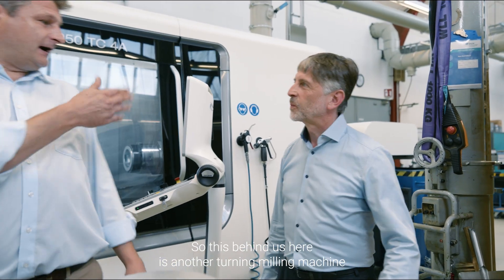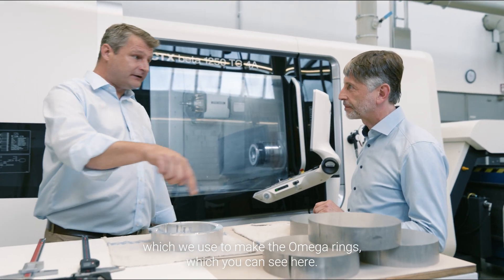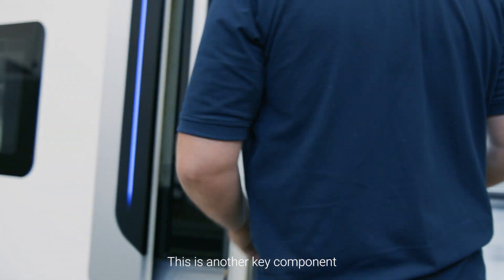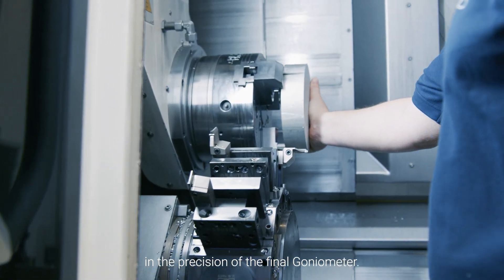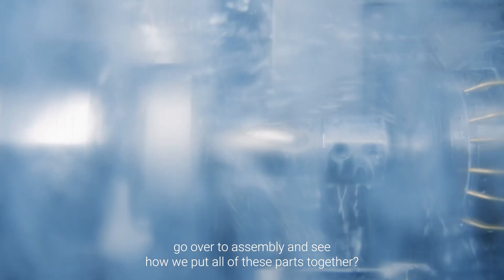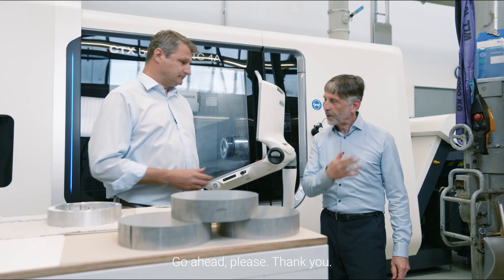This behind us here is another turning milling machine which we use to make the Omega rings, which you can see here. This is another key component in the precision of the final goniometer. So why don't we now go over to assembly and see how we put all of these parts together. Go ahead please. Thank you.